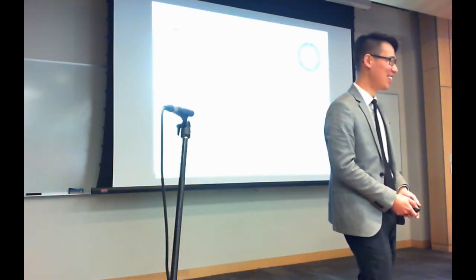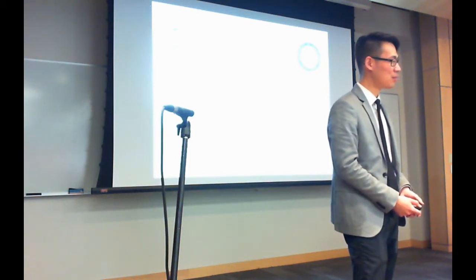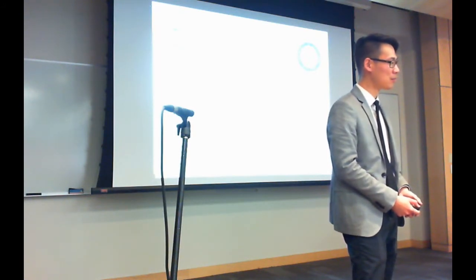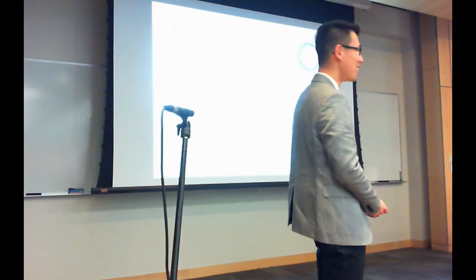To my knowledge, there's more than one model of mass spectrometer in the world. How much variance is there between MS2 spectra depending on the make and model? And how do you consider that in your analysis?